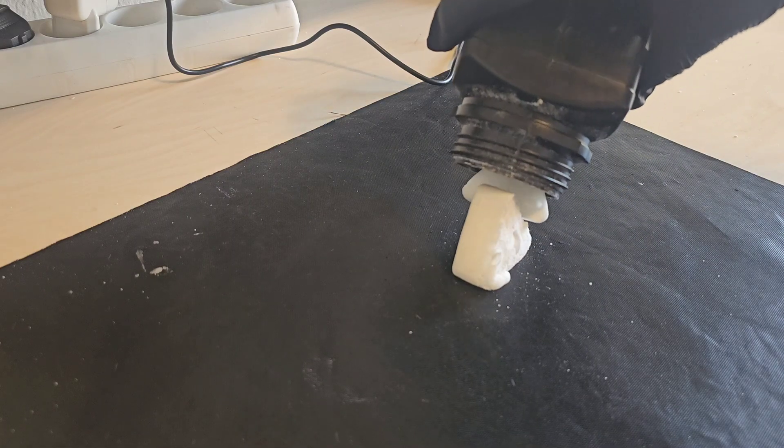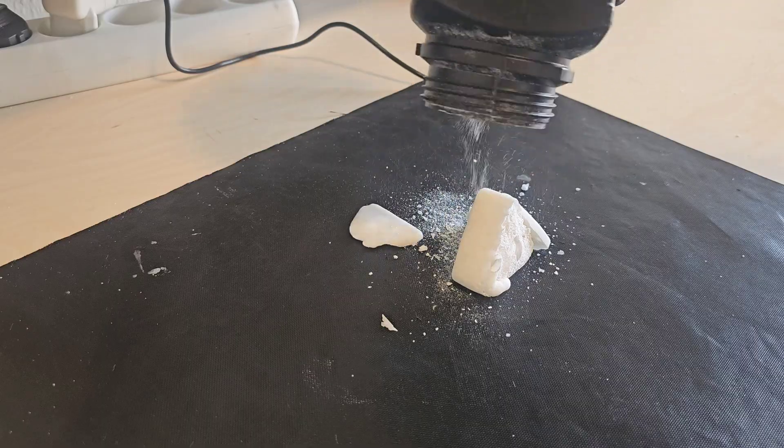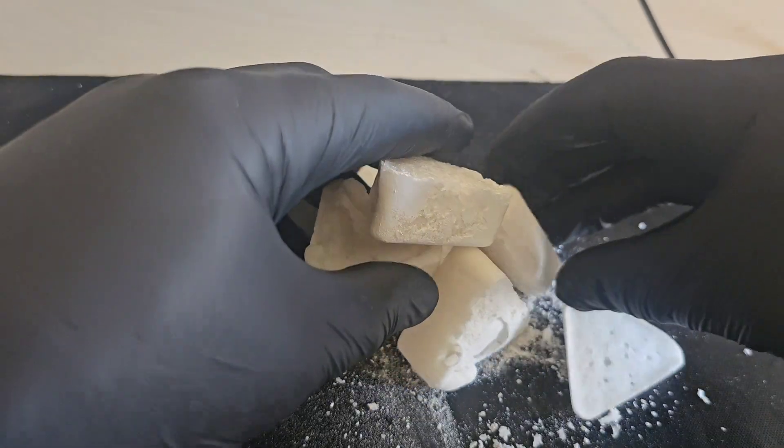Sodium acetate is an interesting chemical with many interesting uses, commonly used to make instant heat packs as well as making pure acetic acid. Today I am going to show you how to make it using simple household chemicals.